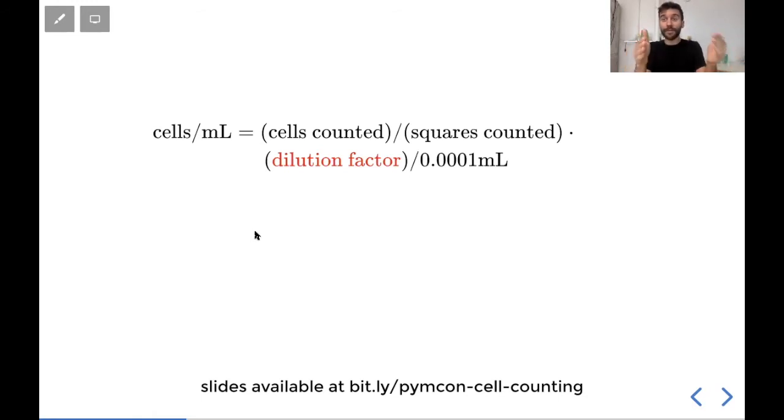And it's really important too, this dilution factor is layered, it's hierarchical. So an error up here propagates quite large as we make further and further, or more and more dilutions.